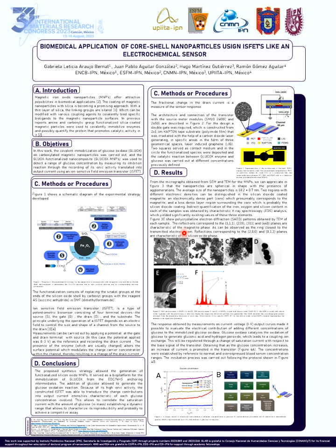Then, the magnetic nanoparticles were characterized using high-resolution microscopy techniques, such as scanning and transmission electron microscopy. The magnetic nanoparticles are nearly spherical in shape, with an average size of 18.2 nanometers, as you can see in this image.